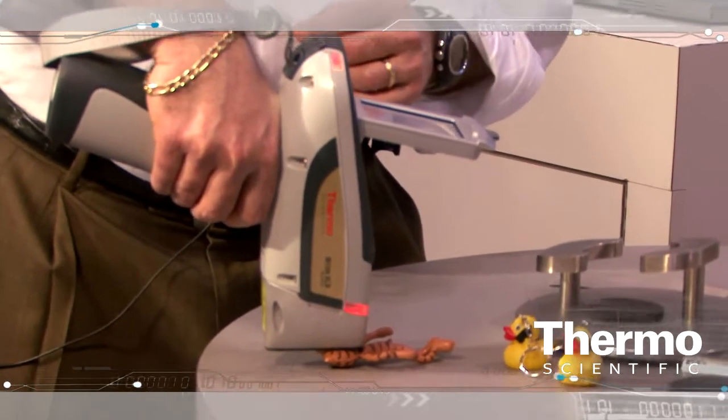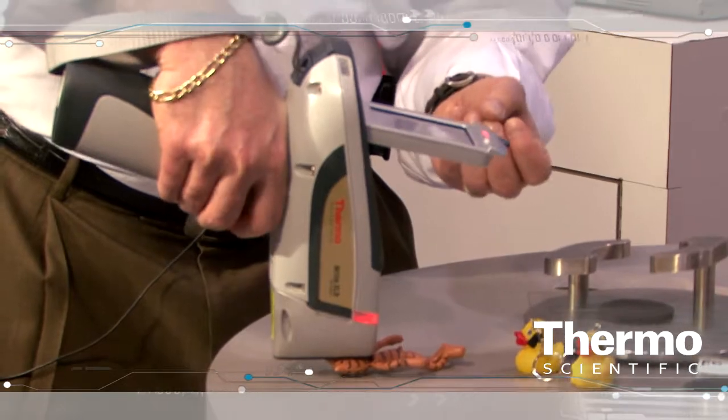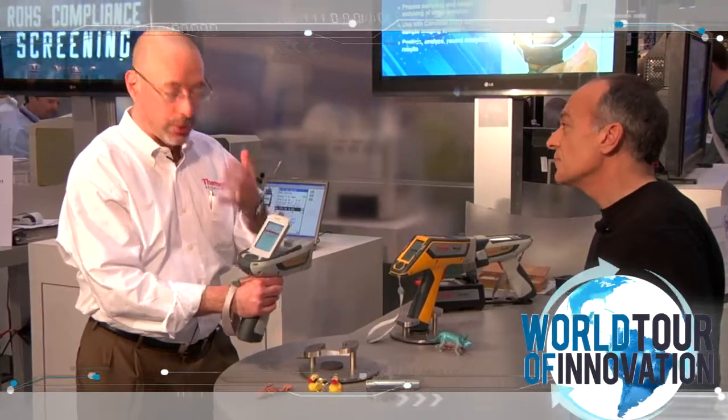The instrument automatically determines the sample matrix. Once it does that, it applies the correct algorithms. And in this case, we can see a very high level of lead. It fails the federal guidelines for lead content in a consumer product of 300 parts per million. So the operator can very quickly determine that this product needs to be segregated from manufacturing.